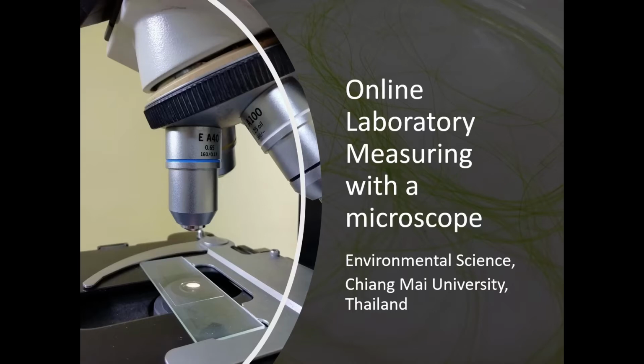The microscopes also help in following the growth and development of organisms and in observing abnormalities of biological specimens such as blood cells.